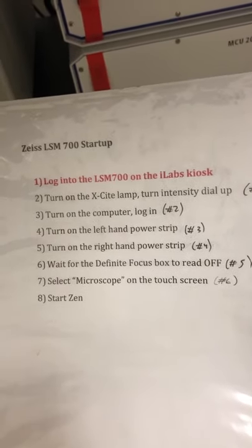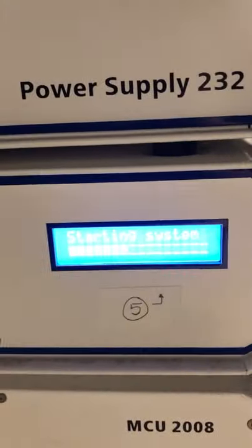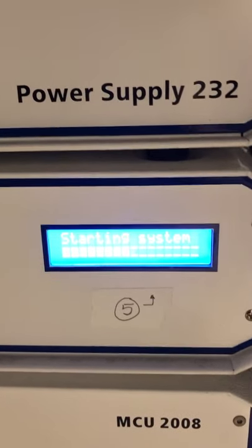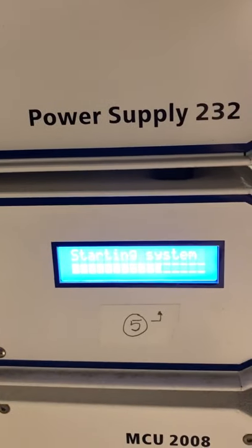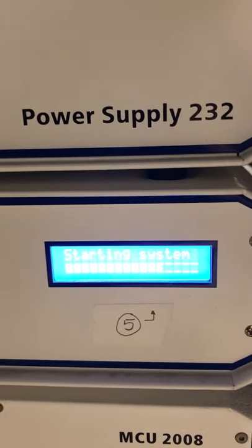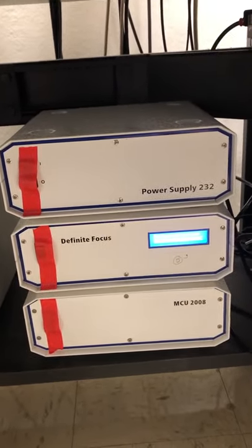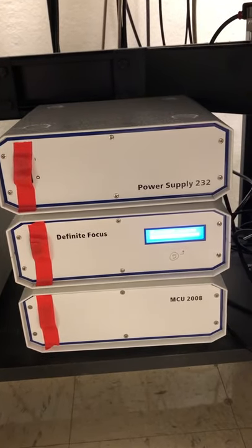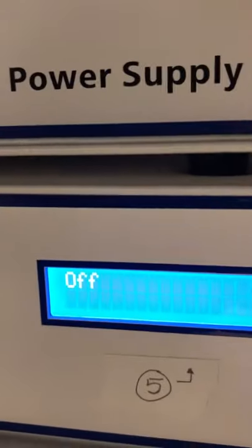Once that's done, we need to wait for the definite focus box to read off. This right here is the definite focus box — it has a display that says 'starting system' with a progress bar. It turns on various things, and the very last thing it checks is an optional component. It should then say 'off,' which is a bit confusing, but you have to wait until it says 'off' before the system is ready to use. You can see now it says 'off,' so we're ready for the next step.